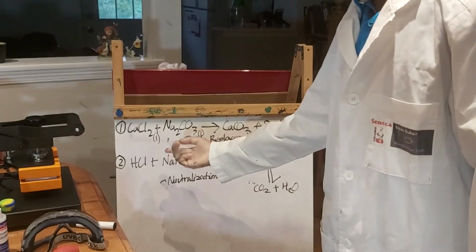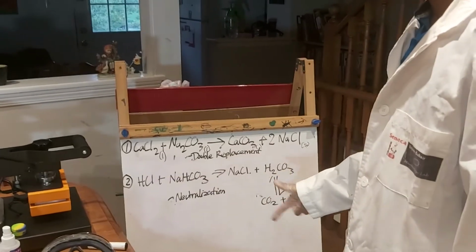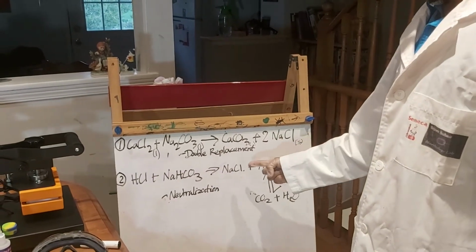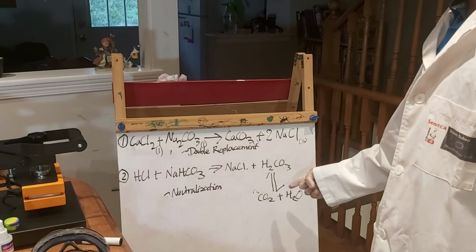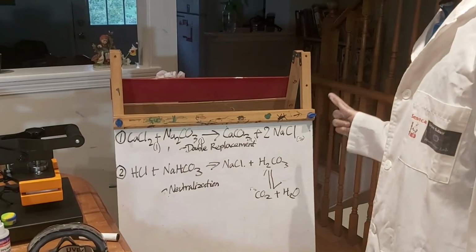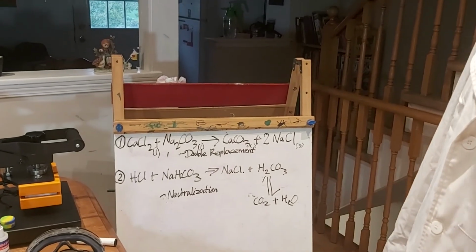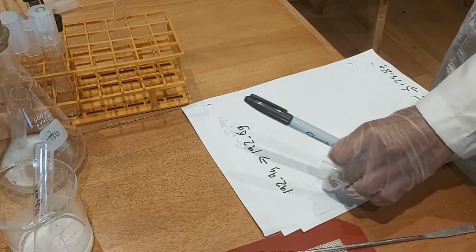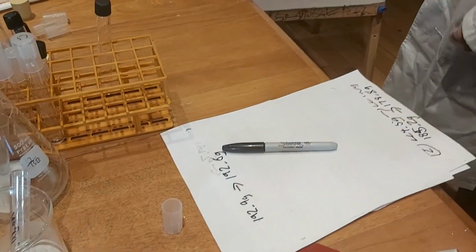However, in the second reaction where you have hydrochloric acid and sodium bicarbonate, in the neutralization reaction, acid and a base, you have sodium chloride, salt, and carbonic acid would dissociate into carbon dioxide and H2O. The carbon dioxide escapes. The weight of the gas isn't that much, but you can still see a difference in the 0.3 gram difference. Here, that's the carbon dioxide escaping.